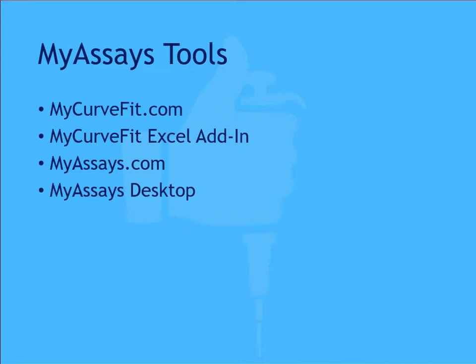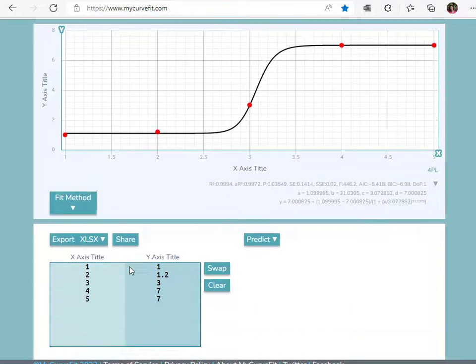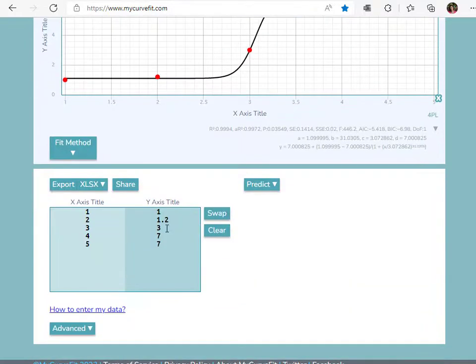By navigating to MyCurveFit.com, you can enter your data point X and Y values.